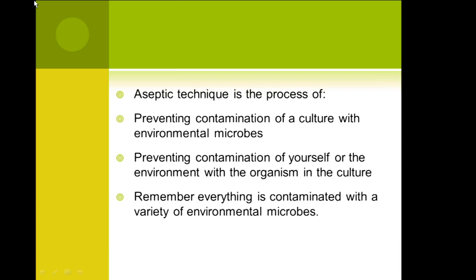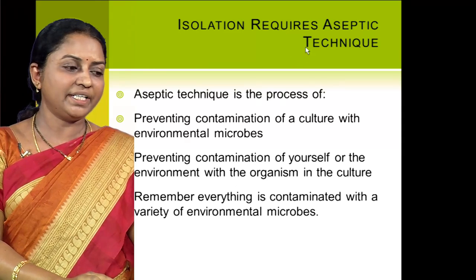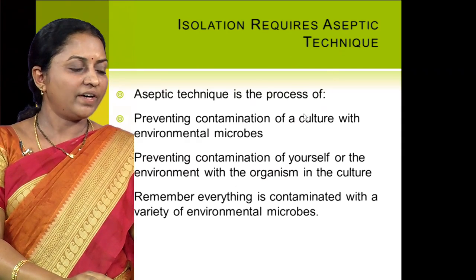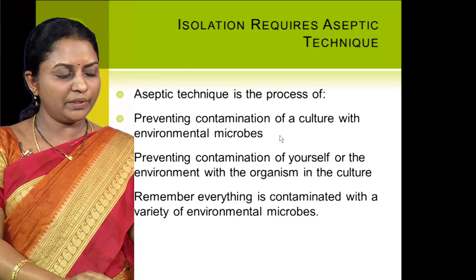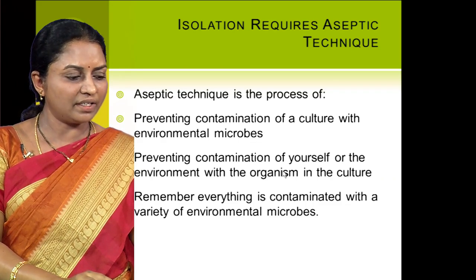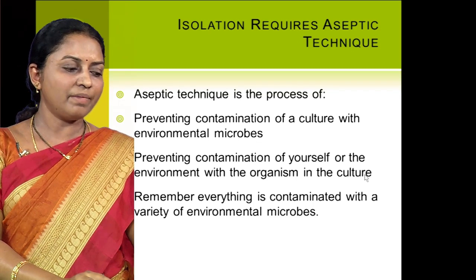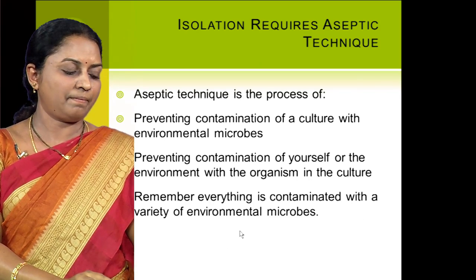Then, while working with microorganisms, you need to maintain aseptic conditions. It is a must. This is required to prevent contamination of the culture with environmental microbes, and to prevent contamination of yourself or the environment with organisms in the culture. Remember, everything is contaminated with a variety of environmental microbes.